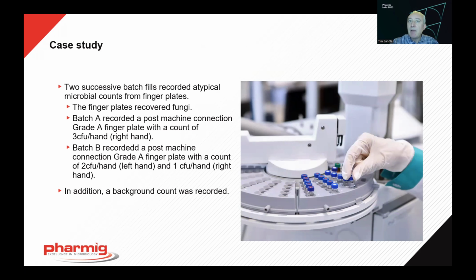With our second batch, again, it was a post-filling machine connection. And with this incident, the operator recovered 2 fungi on the left hand and 1 fungal colony on the right hand side. It's also noticeable that the corridor leading to the film room recovered a fungal count.